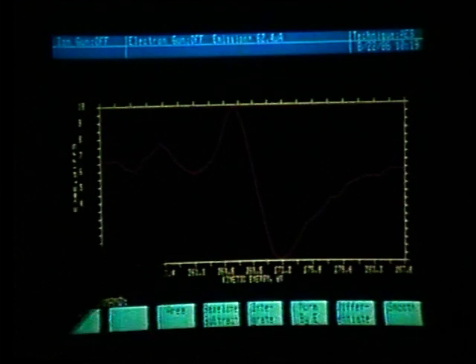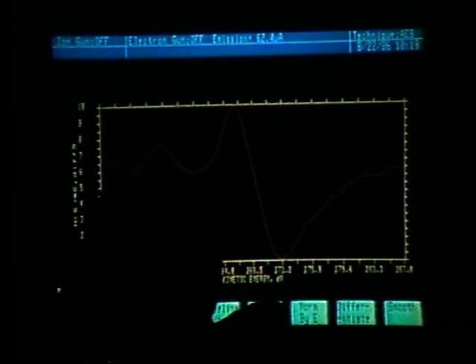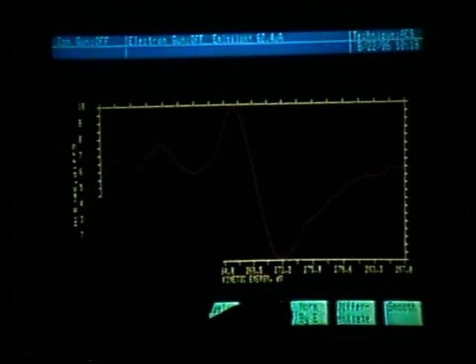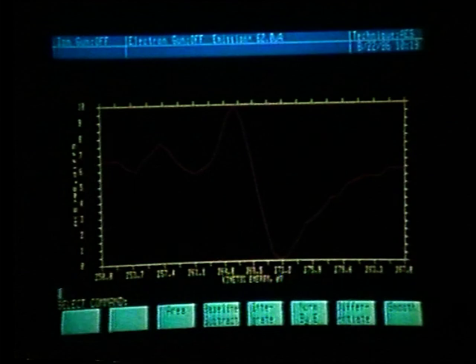For example, if we wanted the atomic concentration calculated on this peak, but not the major peak, we could set a window to encompass a peak within this energy range. It would then measure the peak-to-peak height of the differentiated peak within the newly defined window. Very similar to a profile redefine, which we will be discussing when we manipulate the profile data.